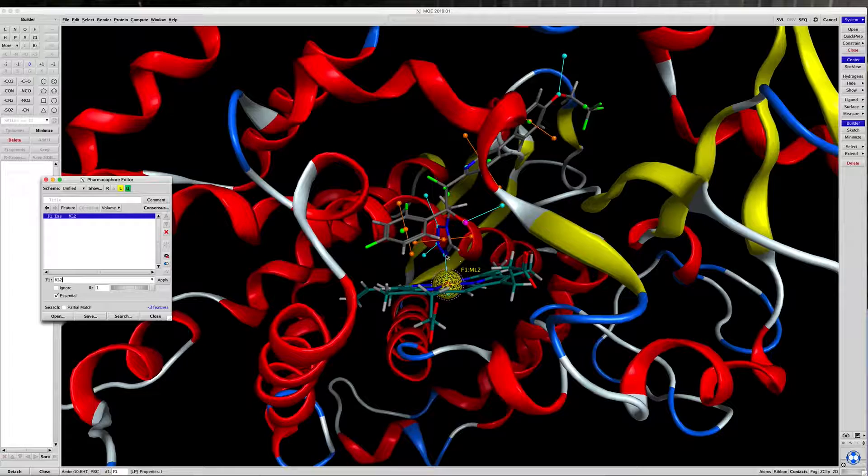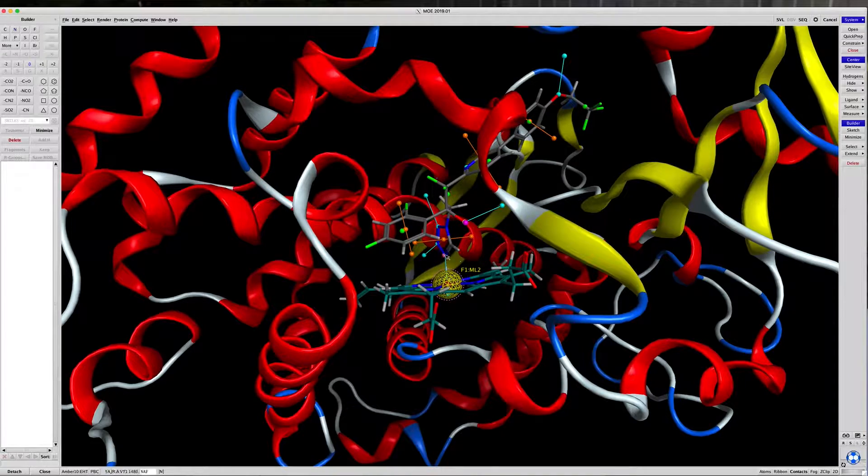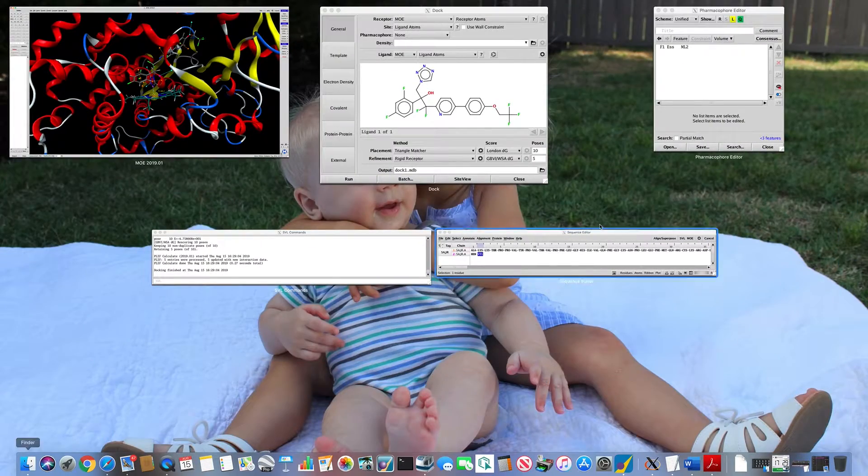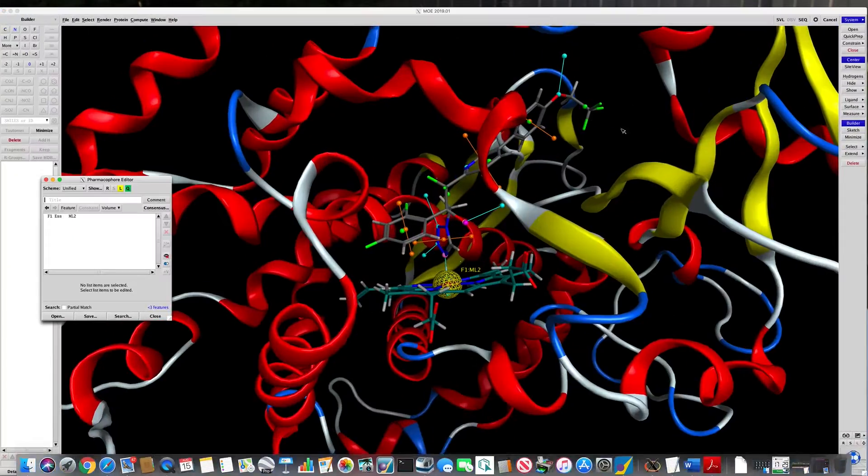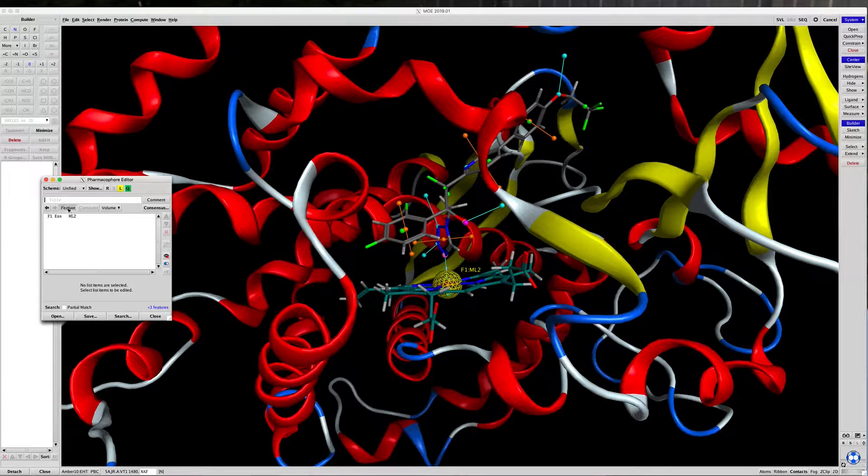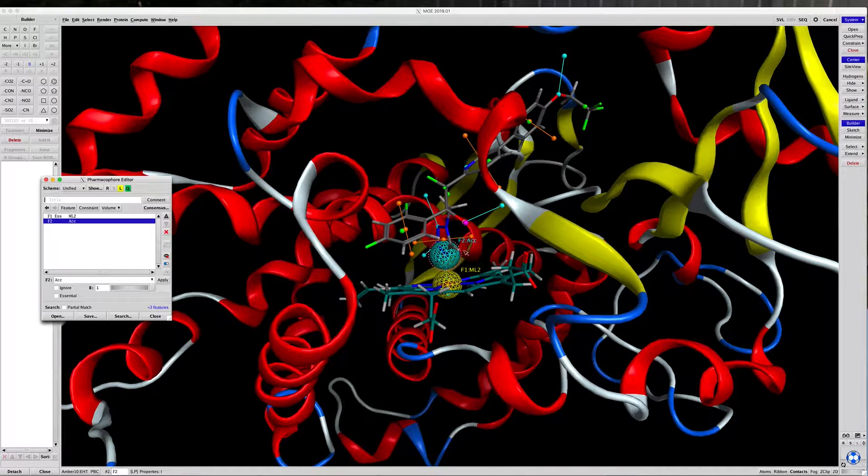Let's click on the 4-nitrogen, and it highlights in pink. Go back to the pharmacophore, click on Feature again, and you should see a blue sphere show up.